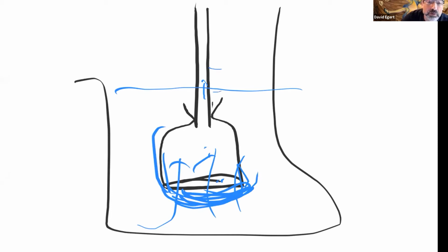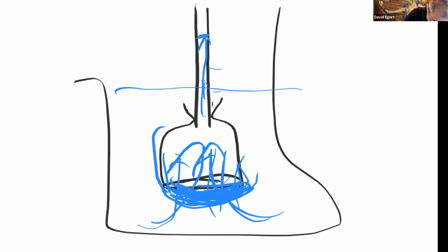So, we're pretending that the height change is the osmotic rate, but really it's connected. If, at some point when this thing really gets taut, any water that comes in is really going up the tube. My sense is the reason why it looks like it's speeding up in that case is you have water coming in, it's just pooching things out, tightening up the membrane, but not going up the tube. So it looks like it's not going up very fast. But then once it gets tight, all of a sudden we see it start going up the tube.